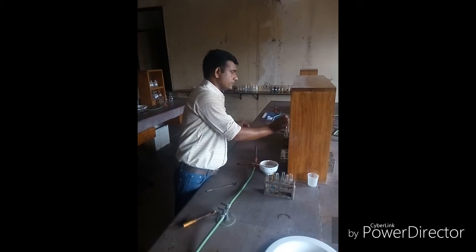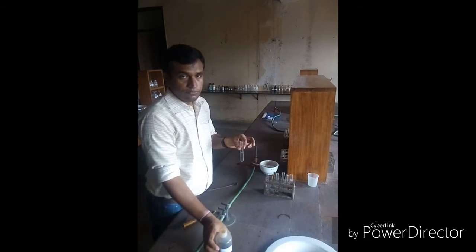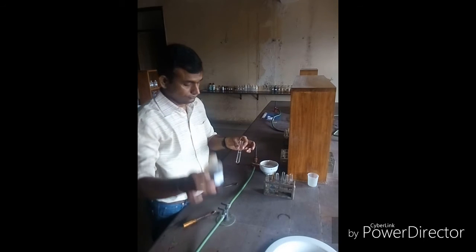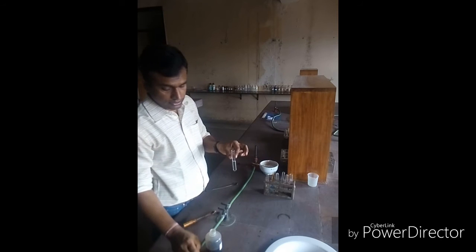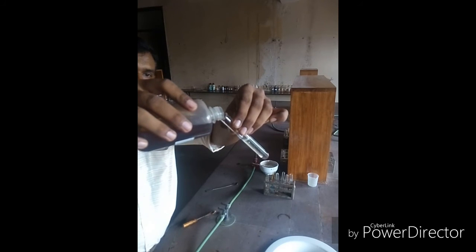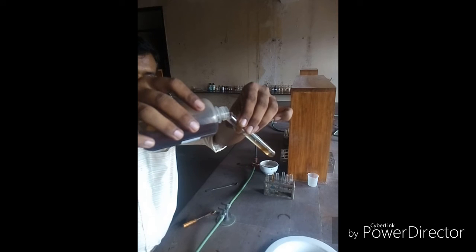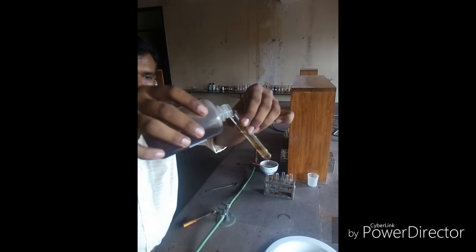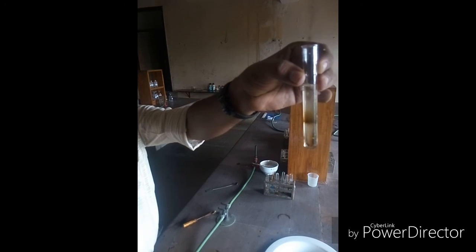After adding the ferrous sulphate solution, add concentrated sulphuric acid to the test tube very slowly along the walls of the test tube. As the sulphuric acid goes inside along the walls, a very clear brown ring is made at the junction of the two liquids, as you can see in the video very clearly. This is the confirmatory test for nitrate salts.